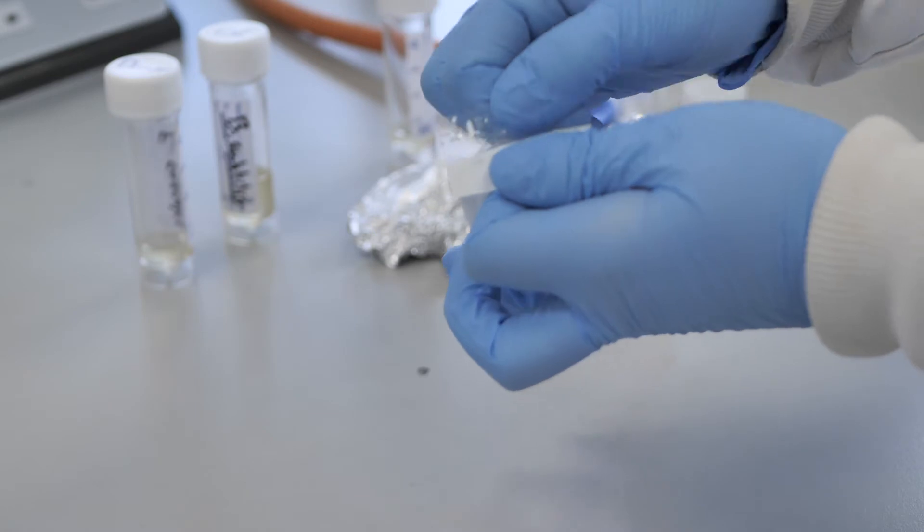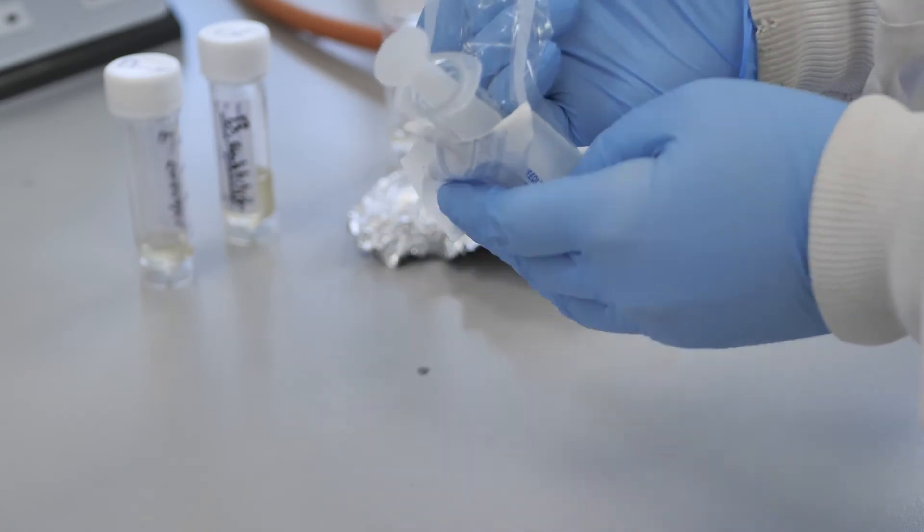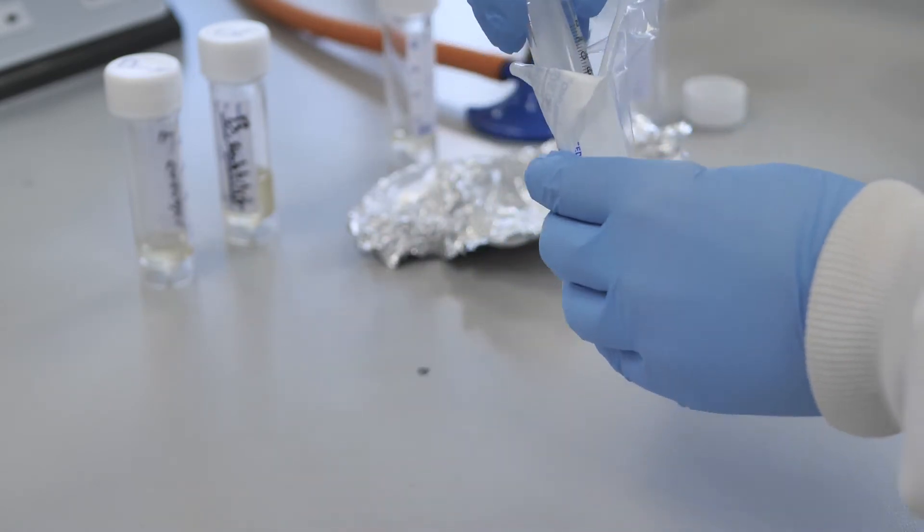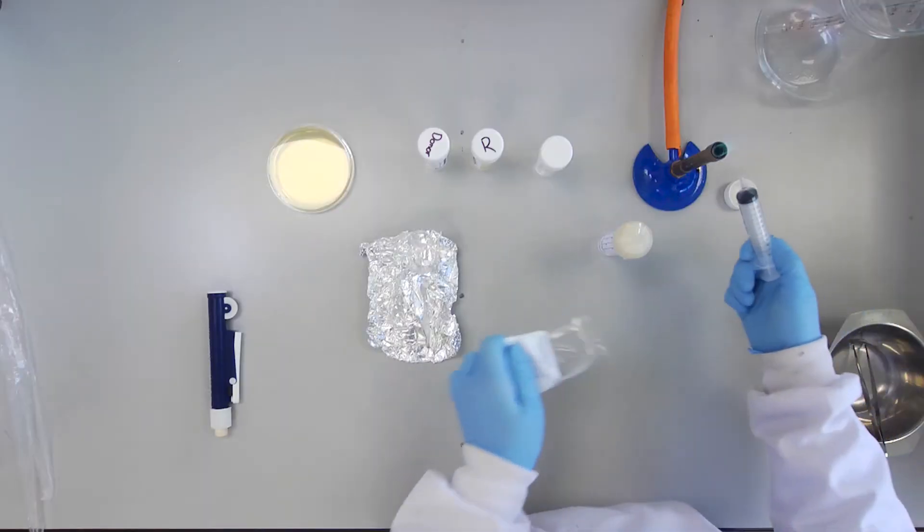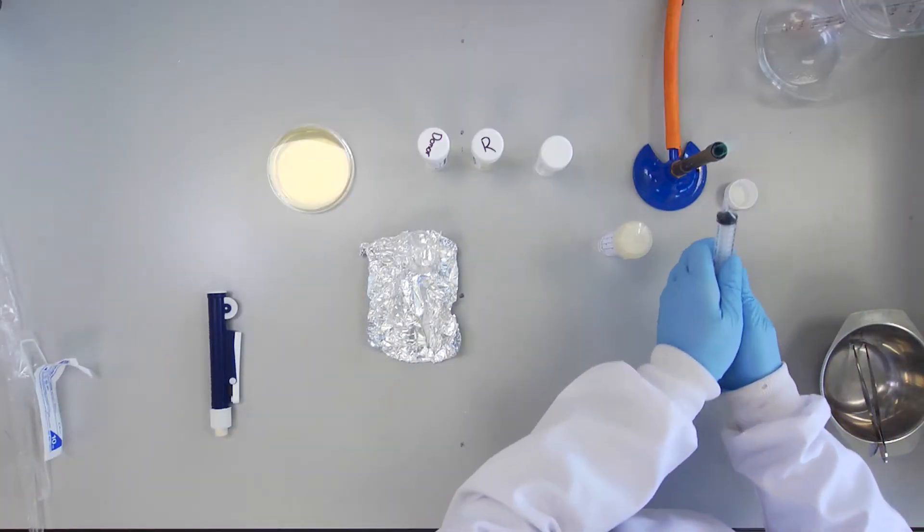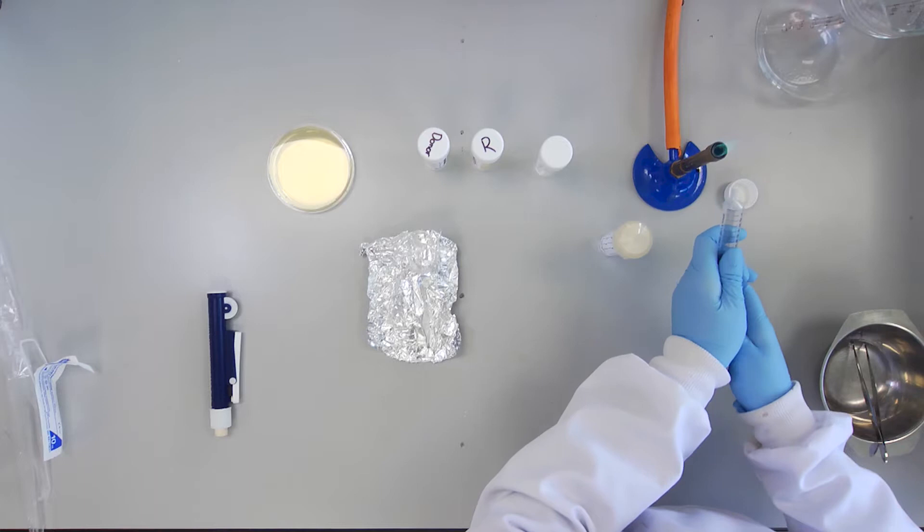Aseptically remove the plunger from a 10 milliliter syringe and secure this on top of the Swinex filter, again working close to the Bunsen flame.